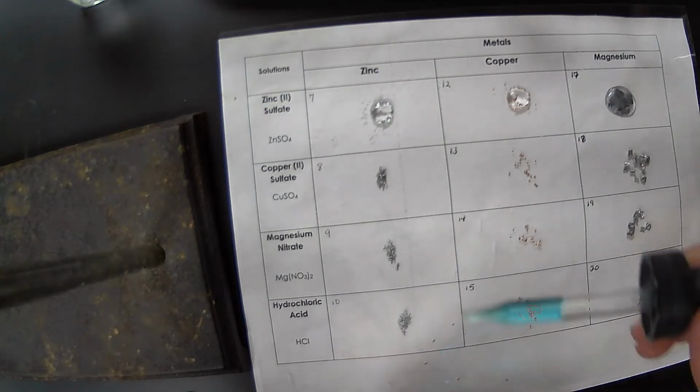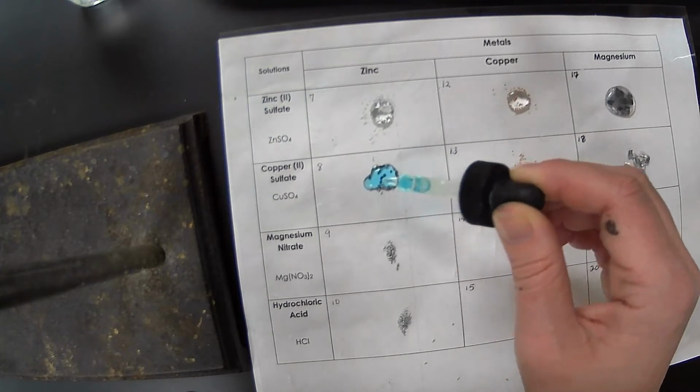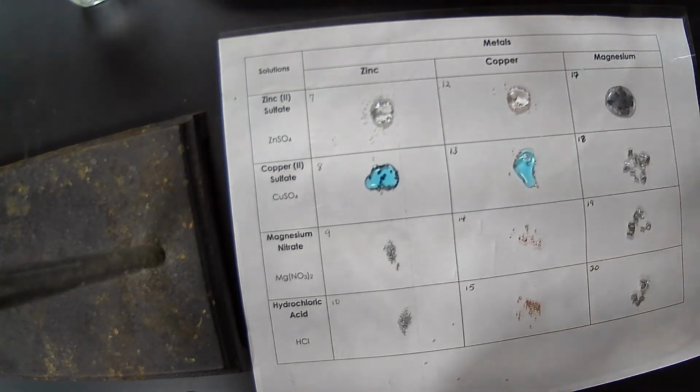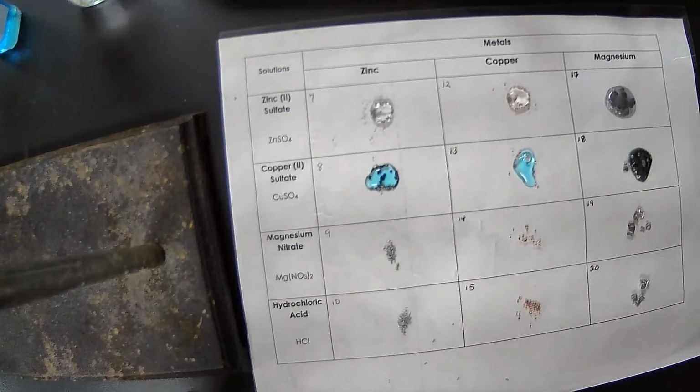Now we've got the copper 2 sulfate. Do the same thing. I'm going to put a couple of drops in each area. Ooh, there we go. Maybe you can hear that sizzling a little bit.